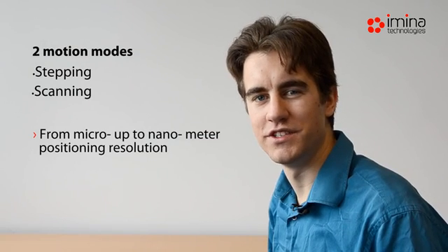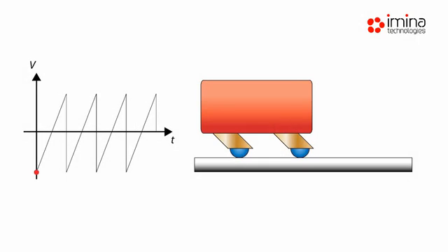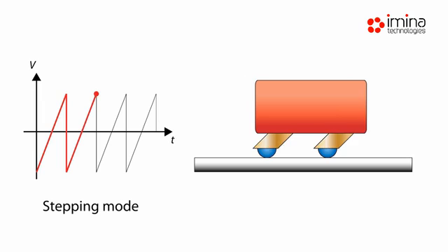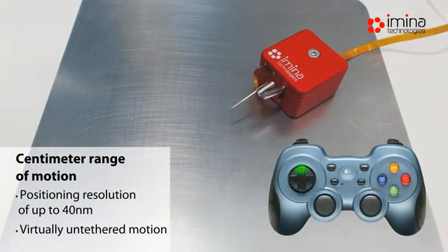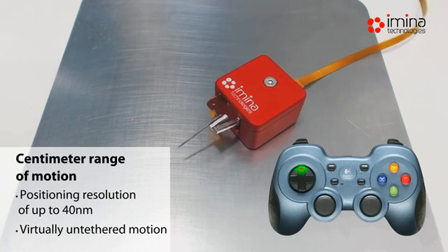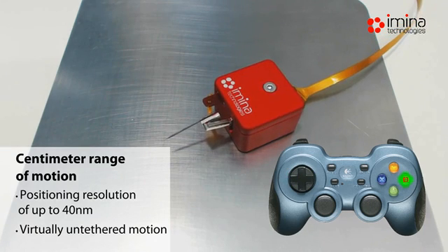The MyBot can move in two different modes: stepping mode and scanning mode. In stepping mode, the piezoelectric actuators of the MyBot are powered with AC voltage signals. No signal is applied on the motors to maintain the position. The MyBot is free to move over the entire surface of the stage, and it is only limited by the length of the power supply wire.